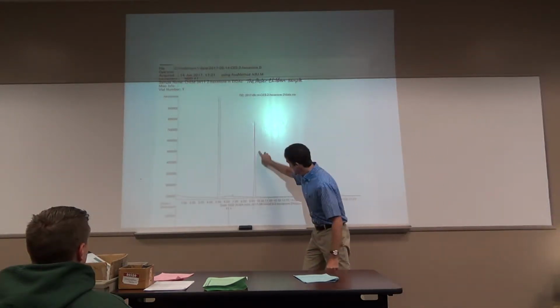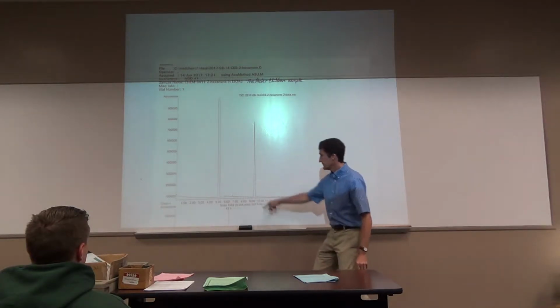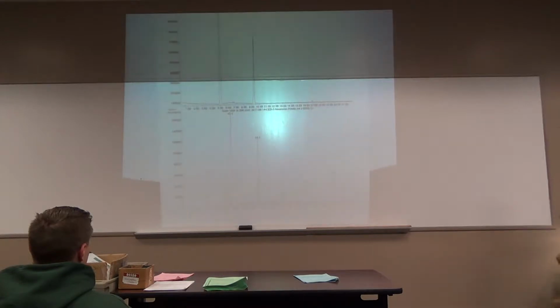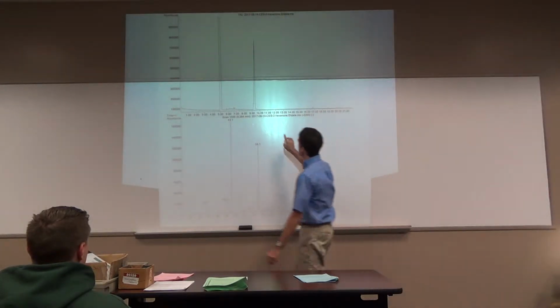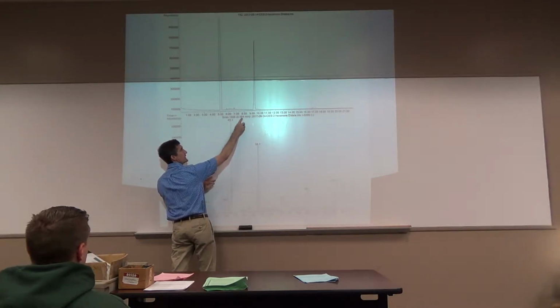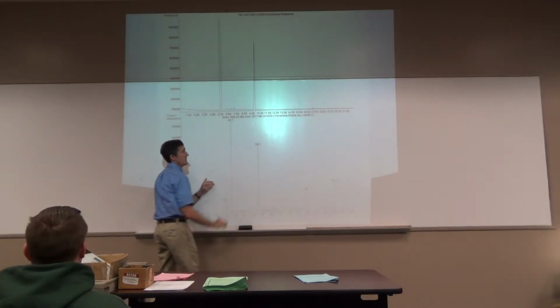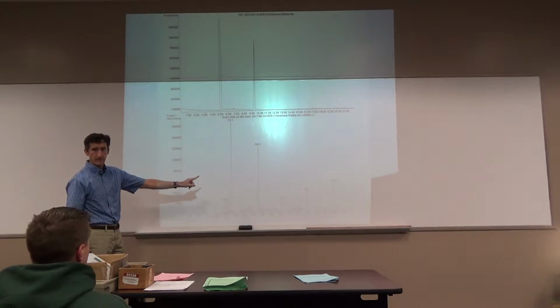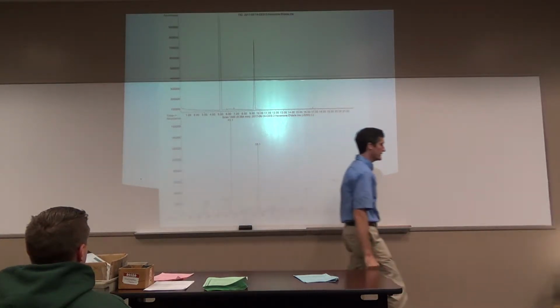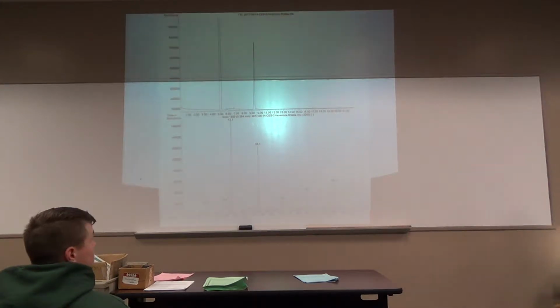For example, this signal here has a retention time of 9.5 minutes. You can click on that and get the mass spec of 9.5 minutes right here. See, this is the mass spec of what was coming out at 9.384 minutes, which is basically under there. Here's your mass spec. I gave you this because you're not running the instrument. That's what you want to sort of interpret.